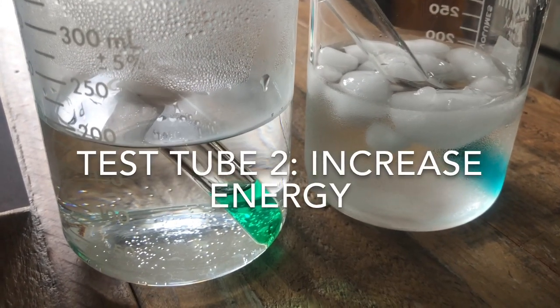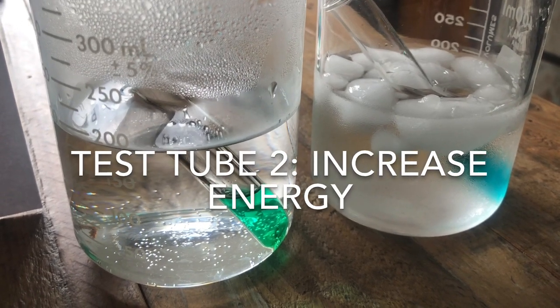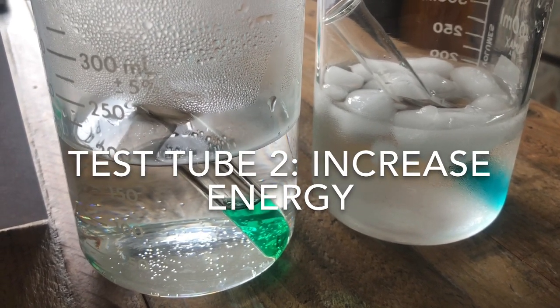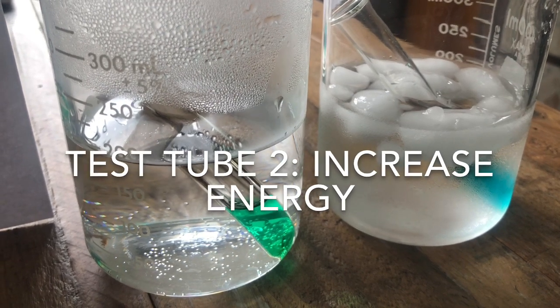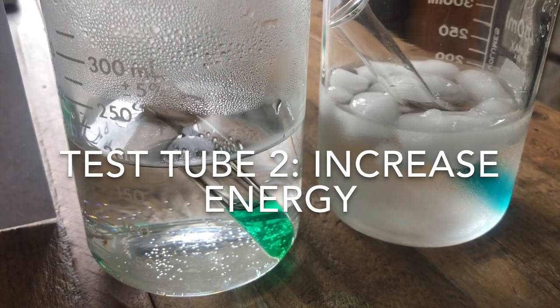What's happening there is that we're increasing the energy of the system. And with an increase in energy of the system, it's going to push the reaction to the opposite side. So it pushes it to the left side, which is why it is turning green.